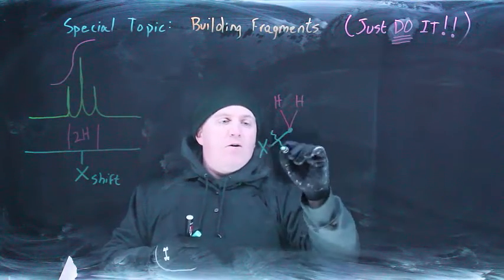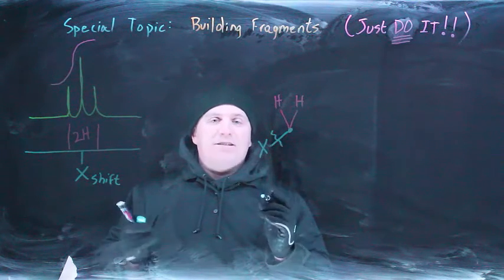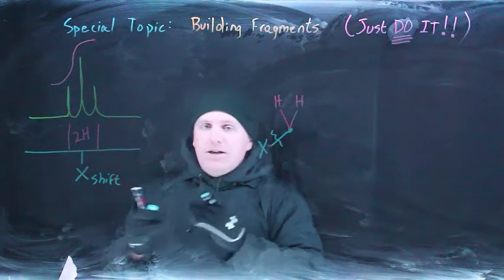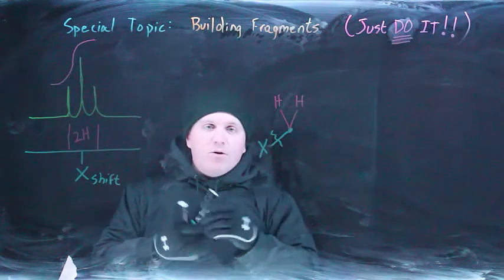I may not know, I may have a squiggle because I'm not sure, but I will almost always try to make a guess as to what'll be out there. And sometimes it's definitive. Right around 2, again, near a carbonyl or maybe near a benzene ring. Right around 4, probably near an oxygen, unless you suspect you have a chlorine, stuff like that.